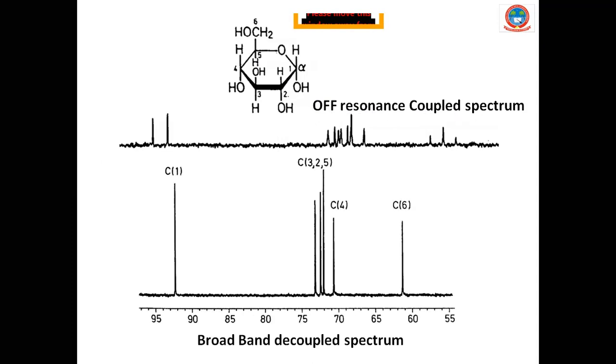See, okay, fine. One minute. This is off resonance. Why? Because the peaks are very small and very merged, but if you magnify this peak, they will give you off resonance. No problem. Okay, so they will appear. In the next molecule we will see, here we will find them similarly. Okay, so you see here six peaks are there. So you can count the peaks also.